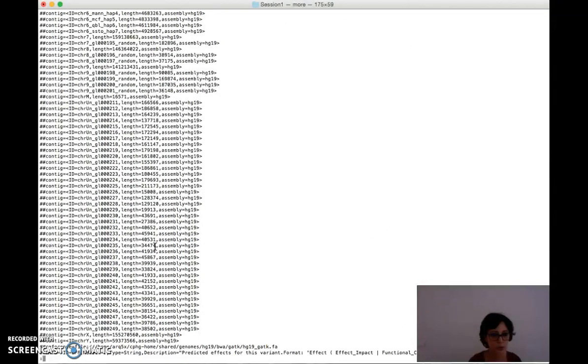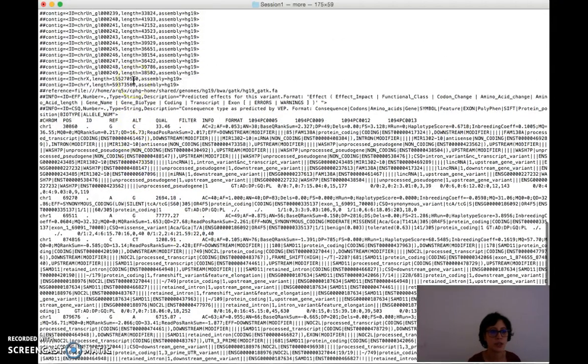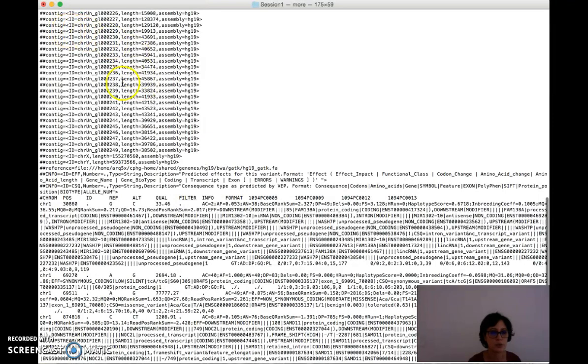Let's view a bit more. And here you have much information related to the contig to which each of these entries is related. And you have now the different fields that I told you about. And here are your 4 different samples. Okay?